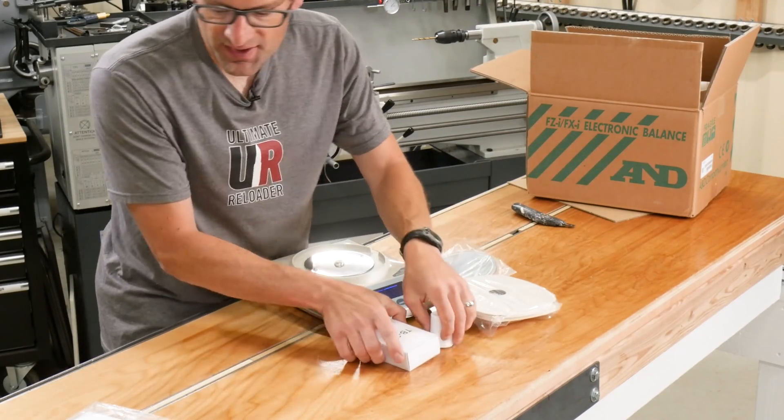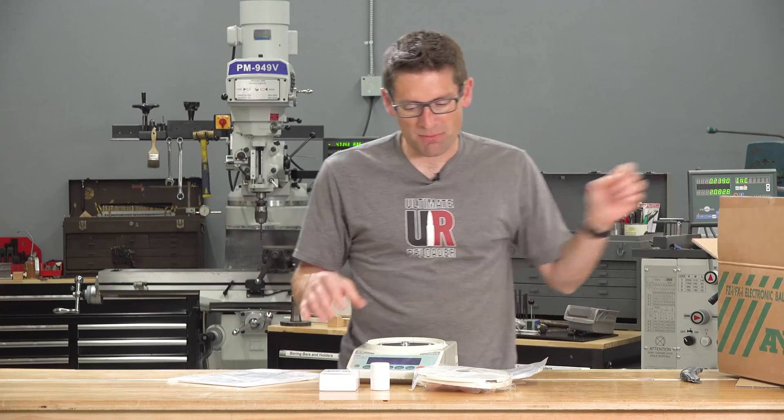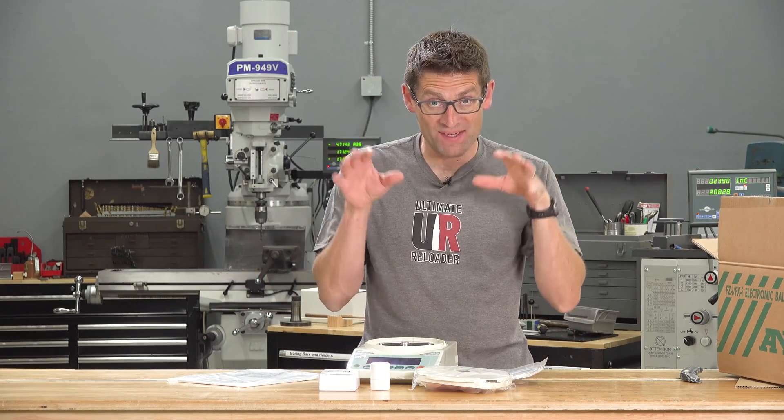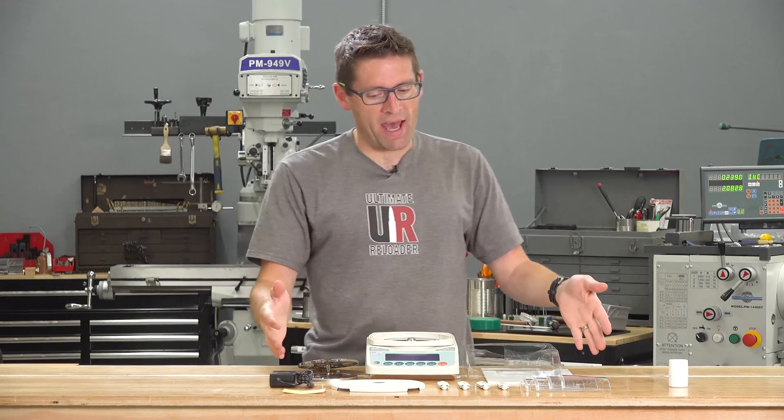So this is what we've got. What I'm going to do is take a quick look at the instruction manual. I'm going to get things staged and I'll show you how this is put together.